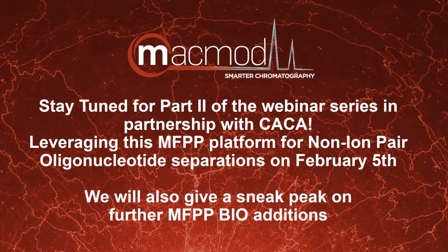That's pretty good in reverse phase. So it seems that as we learn more about this high surface area, if we continue to do some bonded phase innovation, we might be able to bring in more of those polar compounds in reverse phase and not have to do, let's say, ion pair or derivatization or move to HILIC.